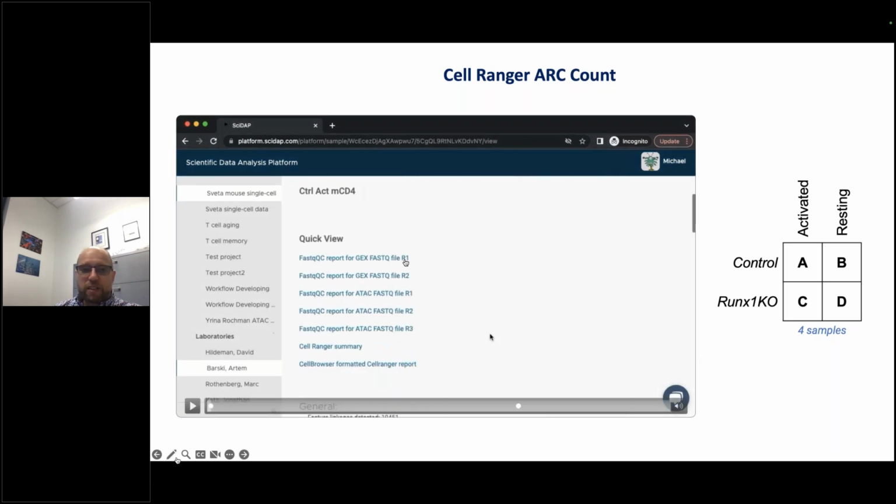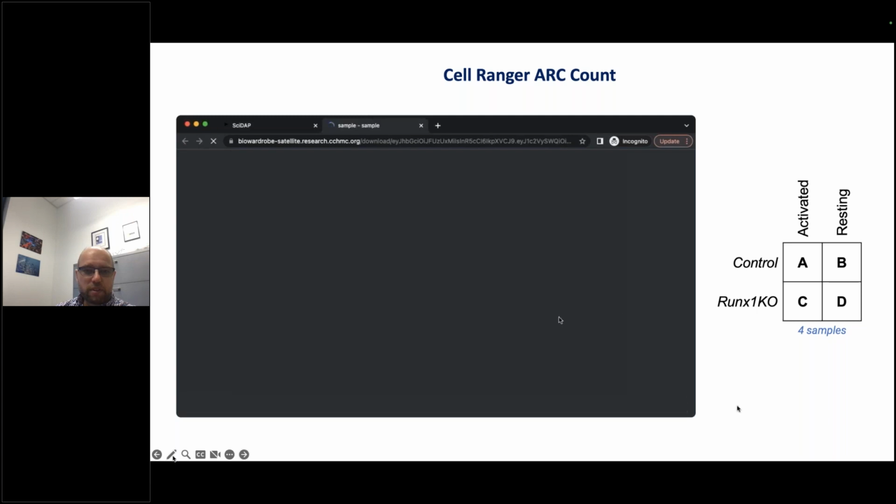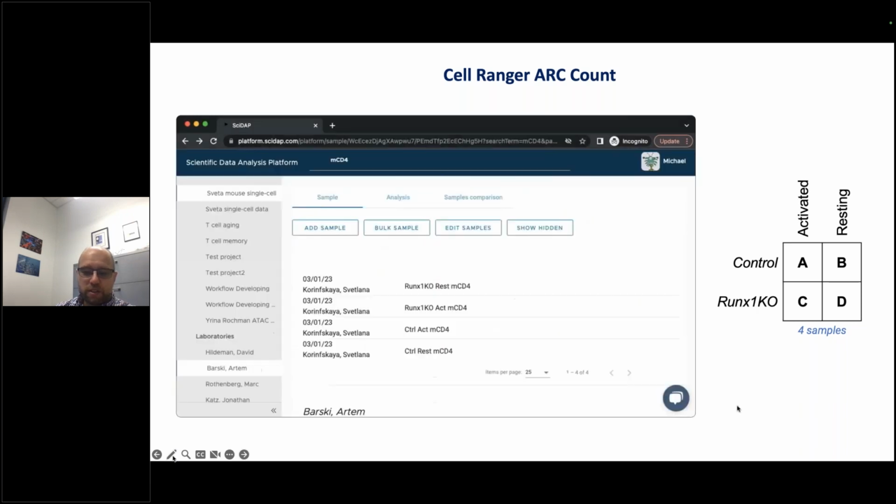Once the data are processed, you can look at the results, and here is a short video describing them.